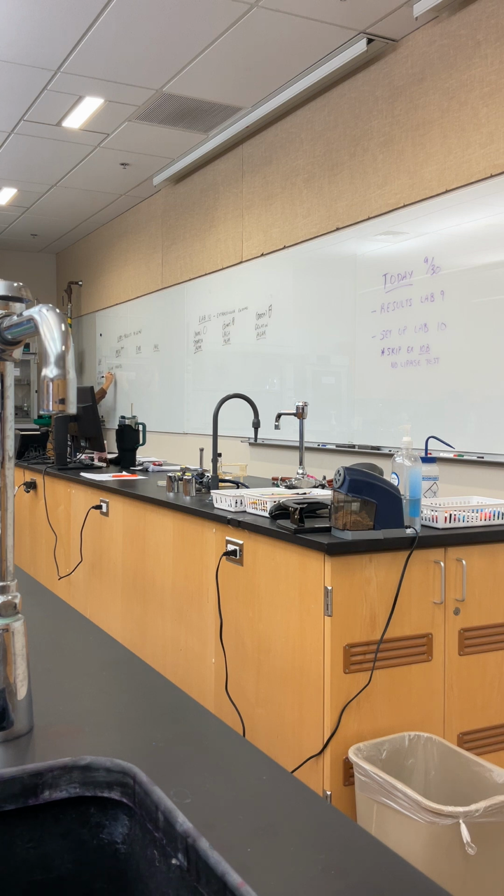What did it mean to be differential? Visual difference. Excellent. So remember, differential just means a visual difference. So what is happening here is some of the organisms that we're plating can eat mannitol. They like that sugar. They have the enzyme to eat mannitol. But other bacteria, they don't have an enzyme to eat mannitol, so they're not going to be able to eat the sugar. So this sugar is going to make our media differential.